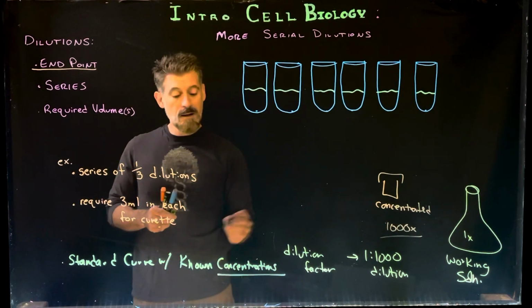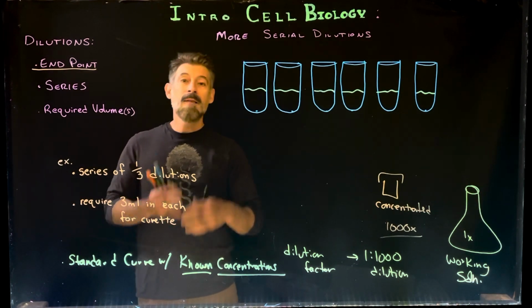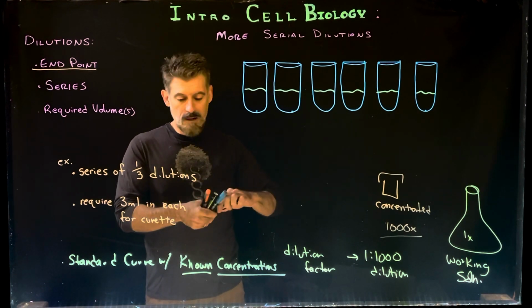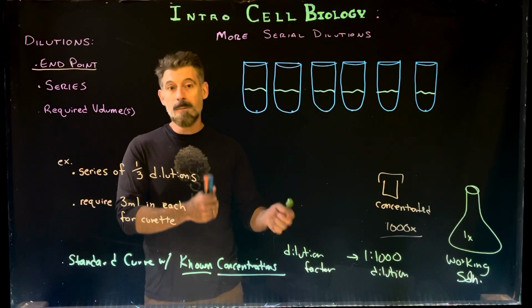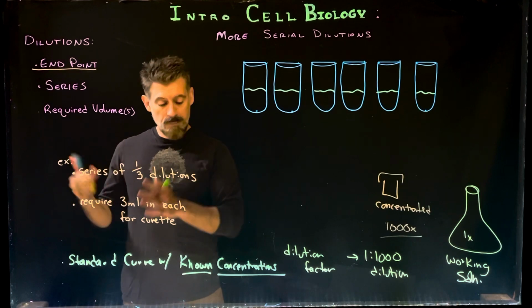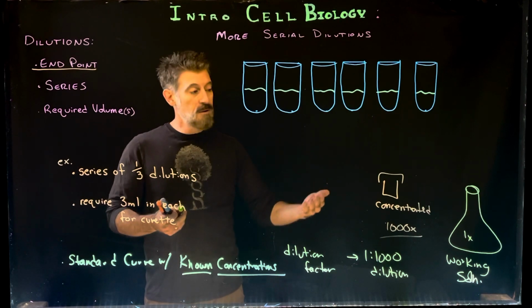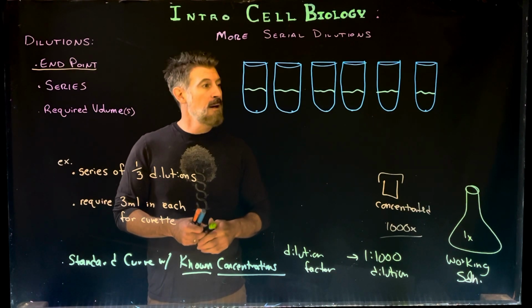So multiple concentrations. We know the concentration of all the solutions, and then we find out how much light they absorb in a spectrophotometer to get absorbance. And then from that, we can later find out the concentration of unknowns. So we just measure how much light they absorb, and then we relate it to the curve, and we can get an equation, and that's a whole separate thing I have some lectures on. That's one of the reasons why we perform the serial dilutions, is to do that sort of thing in lab. And we do it multiple times in our particular class.